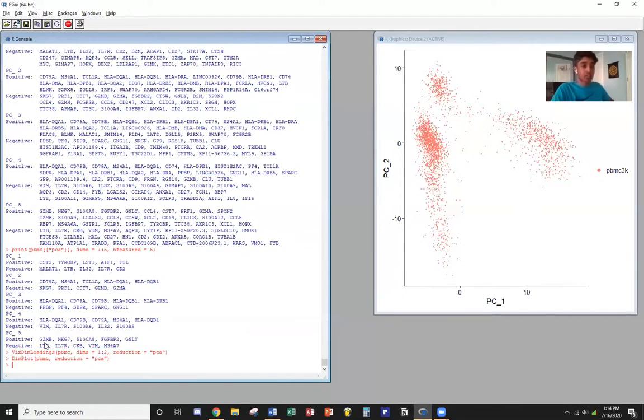And next, we'll be doing the DimHeatmap. The DimHeatmap function I will be using will help the PCs to include further downstream analysis. This is extremely valuable for exploring correlated feature sets. In the guide, I've attached an article you can read that is interesting regarding DimHeatmap, however you wish to say it.